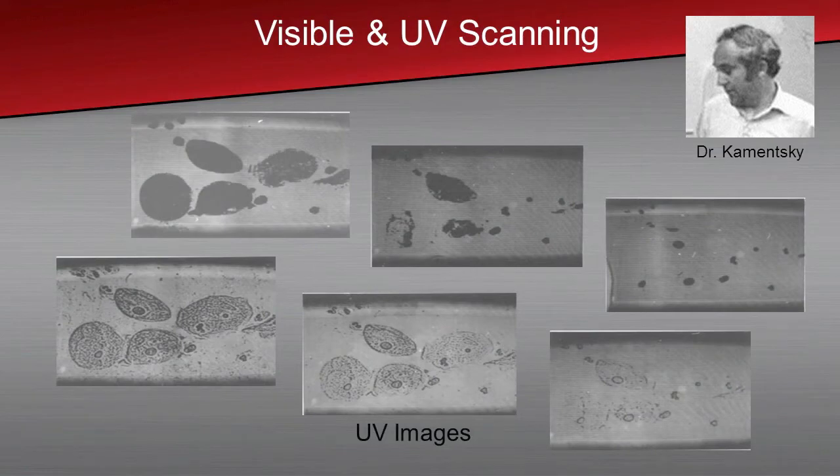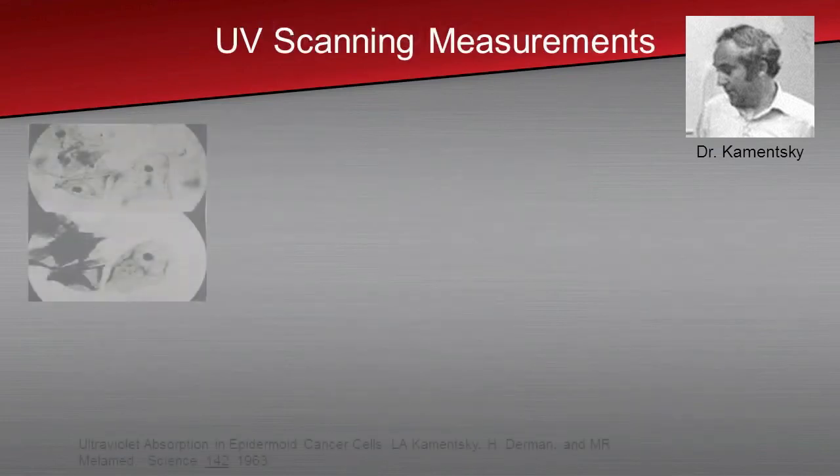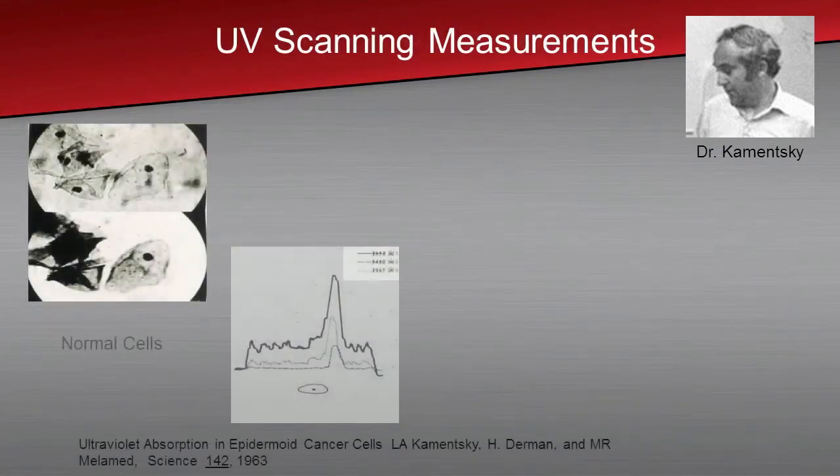techniques of looking at photographs of the cells in the ultraviolet at 2,600 angstroms and I think 2,700 angstroms. 2,600 angstroms gave you what the DNA looked like, and 2,700 angstroms gave you what the proteins look like, and those photographs are actually scans of different cell populations. Then I developed a technique to scan those photographs.